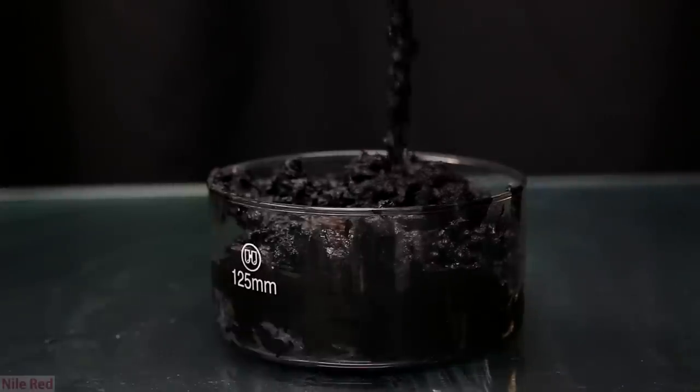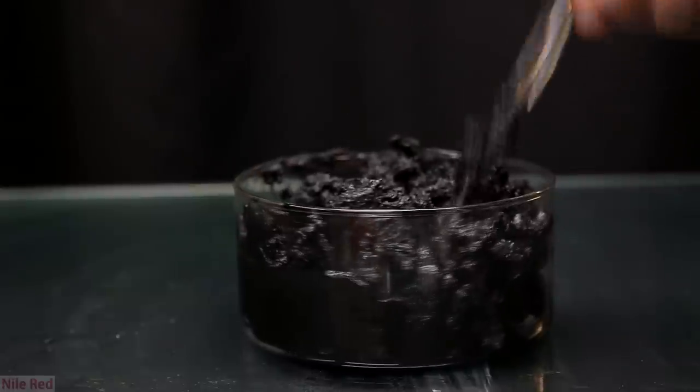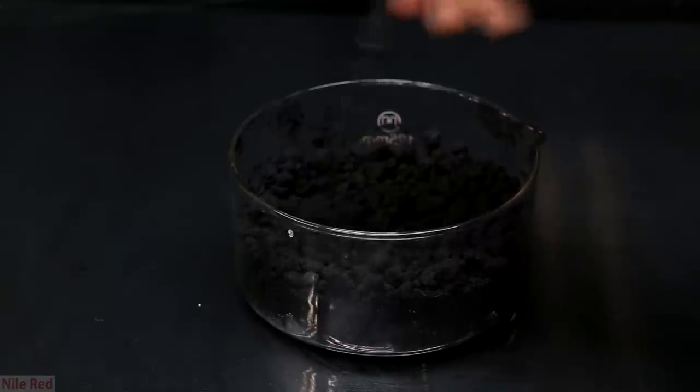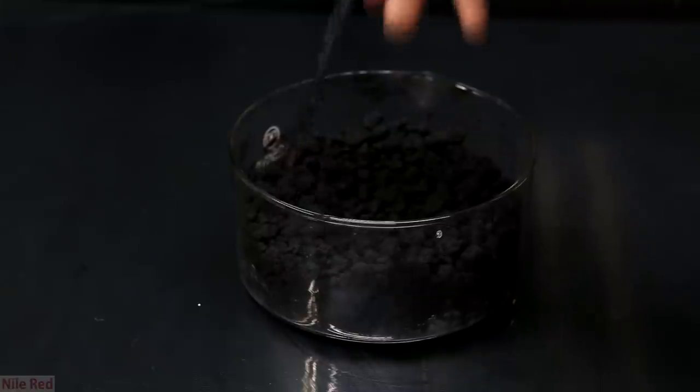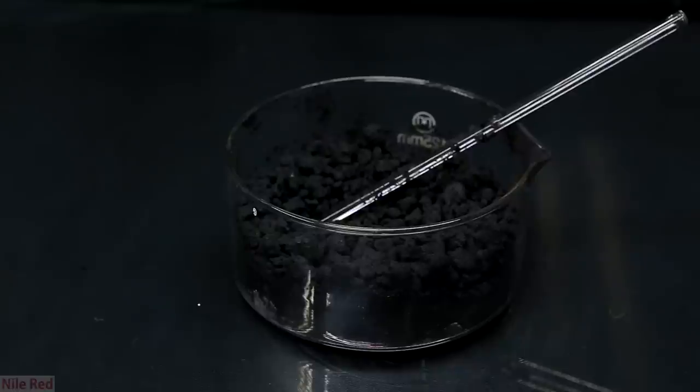Once it was all transferred I was left with a nice amount of black paste. So as I said the next step is to put it into an oven. Once it had dried in the oven for a little while you can see the big difference. We're left with a nice clumpy mixture of manganese dioxide. If you want you could break up these clumps and powderize them but I honestly didn't really care.